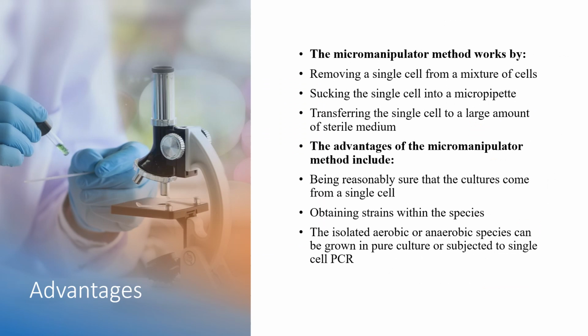How does the micromanipulator method work? The micromanipulator method works by removing a single cell from a mixture of cells.